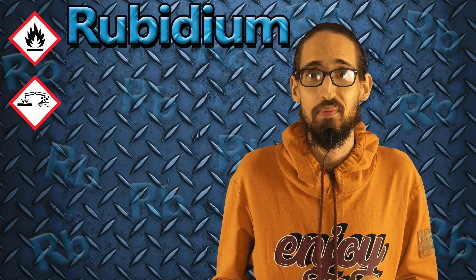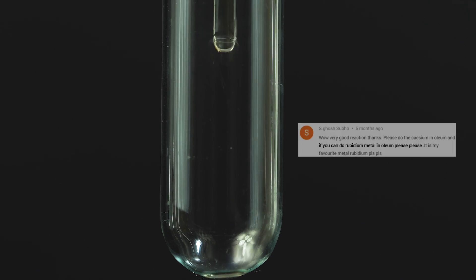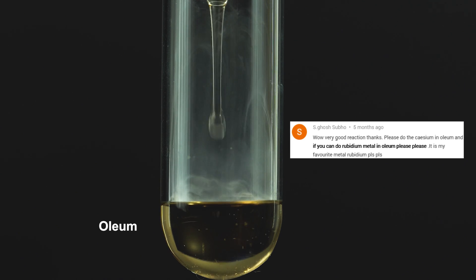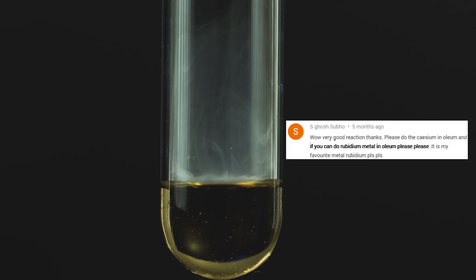Then I'll drop a piece of metal rubidium in oleum. Although this reaction will not be as impressive as the one with potassium, let's do this anyway, just because I can.